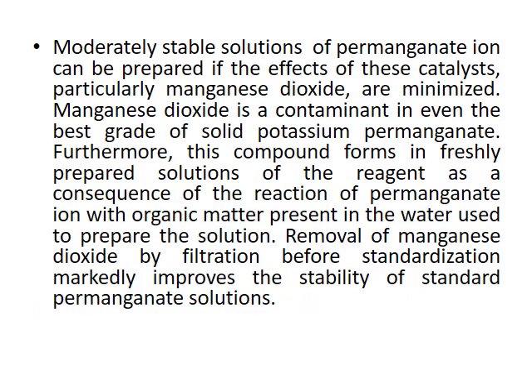Manganese dioxide is a black contaminant usually present with KMnO4. Also, it can be produced during preparation of the KMnO4 solution due to the reaction of KMnO4 with organics probably present in the water used in preparation. Preventing the formation of manganese dioxide or removing it by filtration greatly improves the stability of the KMnO4 solution.